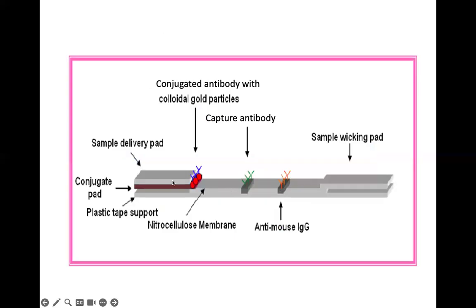So in detail, very important. As I mentioned, the sensitivity of the rapid test kit for lateral flow depends on the design of the lateral flow. There are two biggest factors. One is how well you manage your conjugate pad, and also the sample pad, how we prepare the sample pad, and also the length.